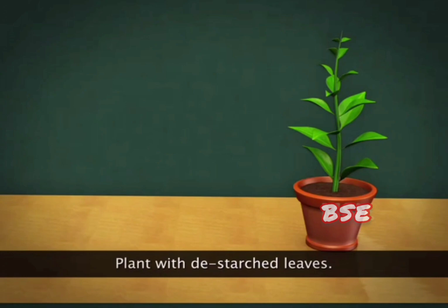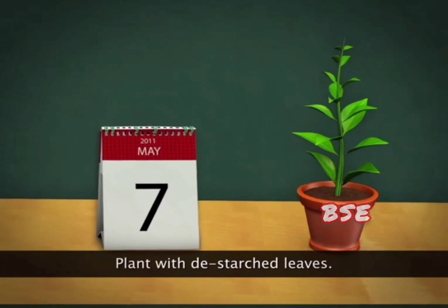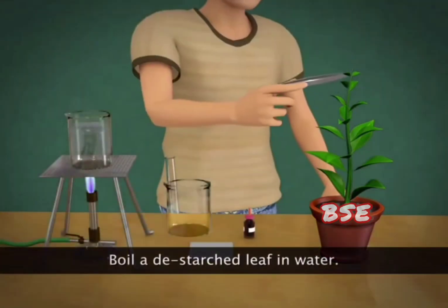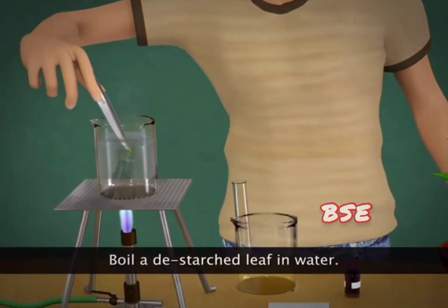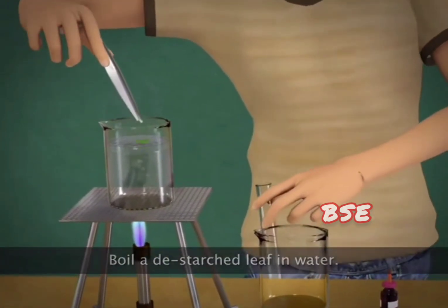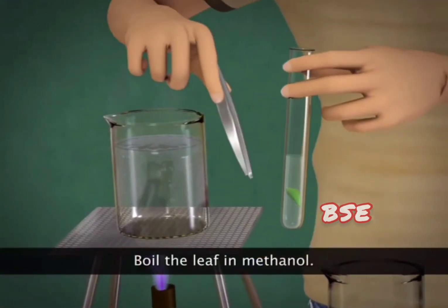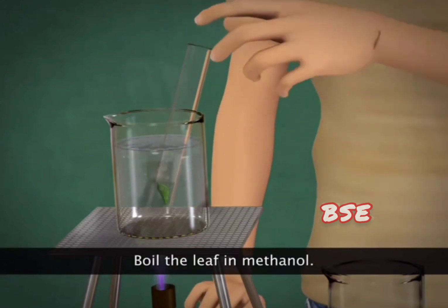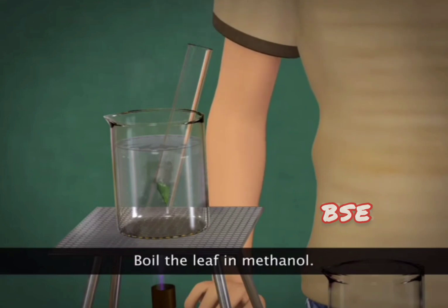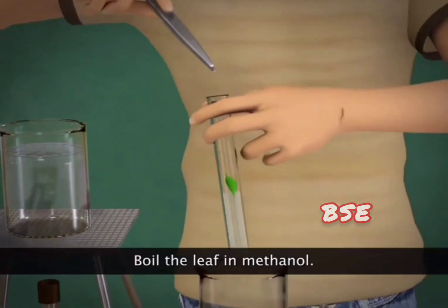Destarch the leaves of a potted plant by keeping the plant in the dark for 2 to 3 days. Pluck a leaf off it and boil it in water. Next, pour off the water and boil the leaf in ethanol or methanol over a boiling water bath. Keep boiling until the leaf becomes pale white. This indicates that chlorophyll is removed. This procedure causes the leaf to become brittle.